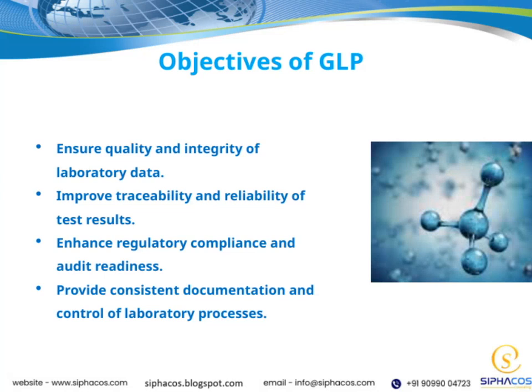Ensuring the quality and integrity of laboratory data is fundamental to our work. When data is accurate and reliable, it builds trust in our results and supports sound decision-making. Improving traceability and the reliability of test results means we can track every step of the process and ensure consistency, which is crucial for maintaining high standards.